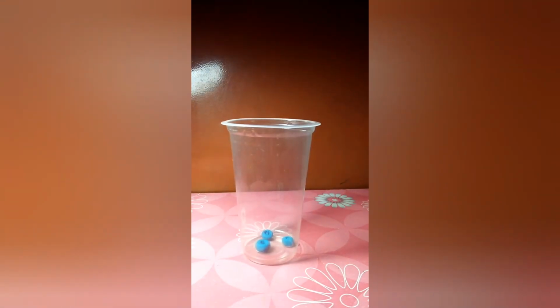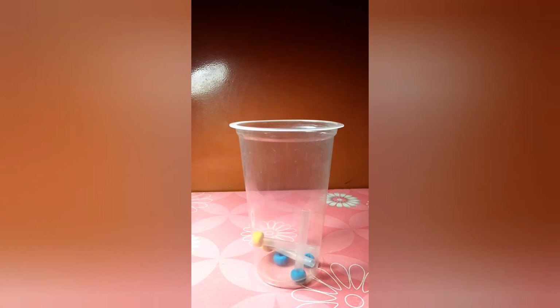Okay, so now look at the competitive ELISA, which is slightly different and also known as inhibition ELISA. This assay measures the concentration of an antigen by detection of signal interference. Here, the reference antigens are already immobilized on the surface of the well. Now the pre-incubated sample, that is, there can be an antigen attached to the antibody or sometimes only antibodies present, is then added to the well.